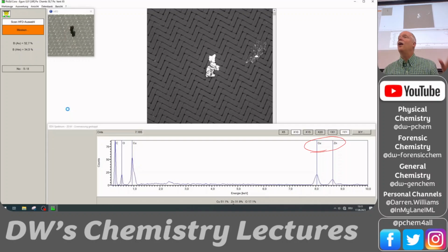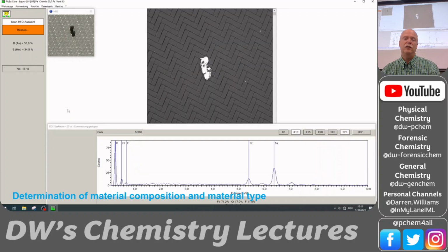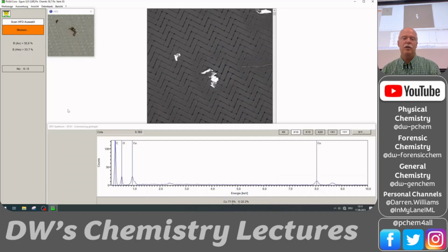And again, it's done automatically for you. So in a forensic situation, if you could do this, you could hit those particles, you could say, silicon oxide, or an aluminum oxide, maybe it's a clay. It's zinc and copper, it's a brass particle. So this is really great that you can do this particle analysis. Here's some more chromium and iron, so that's a steel particle.